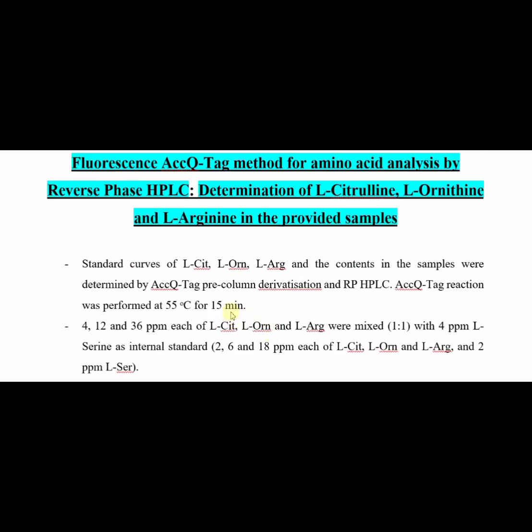First of all, standard curves for L-Citrulline, L-Ornithine, L-Arginine and the contents in the samples were determined by the AccQ-Tag pre-column derivatization method, that is by RP-HPLC. The AccQ-Tag reaction was performed at 55 degrees centigrade for 15 minutes.